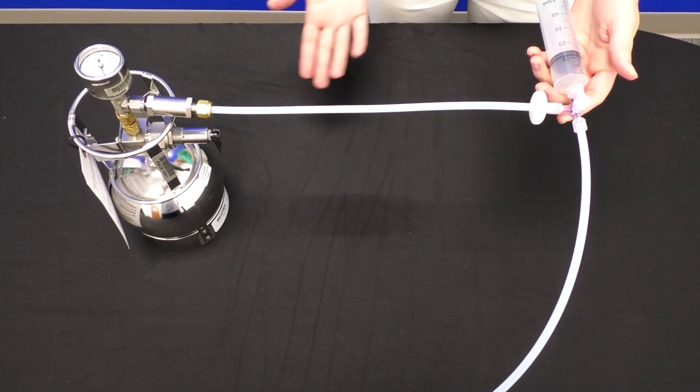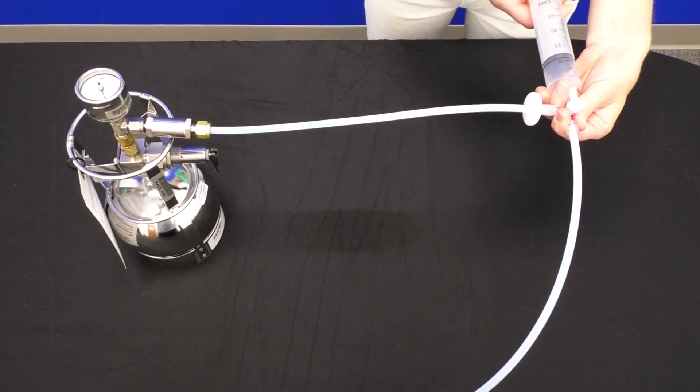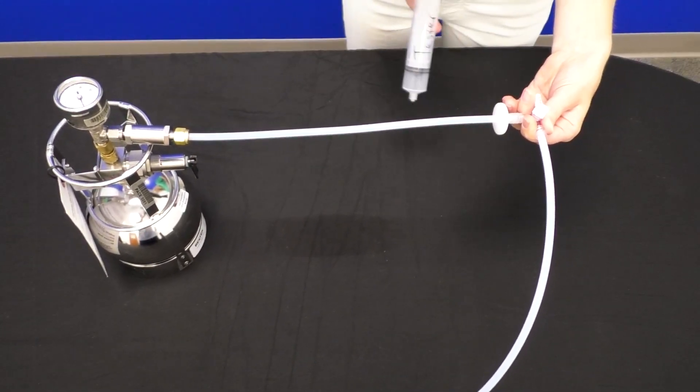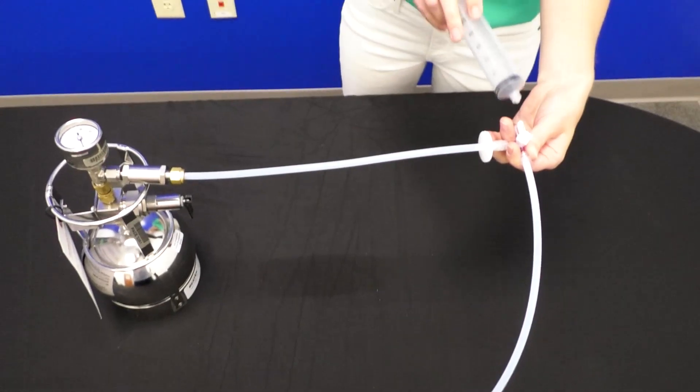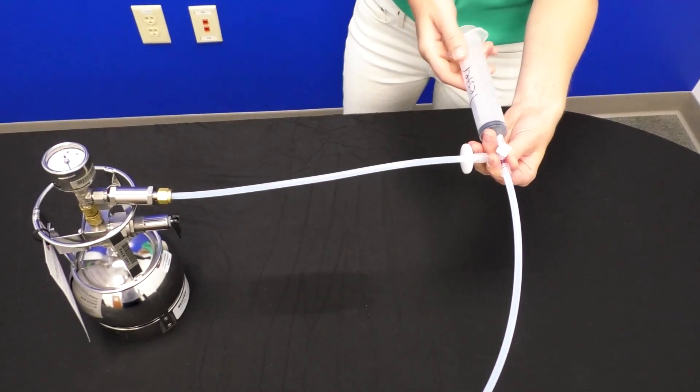And then once your leak check is confirmed, if you would like to purge your sampling line, you can use the syringe in the same way. Just unscrew it and exhaust the air that you drew out.